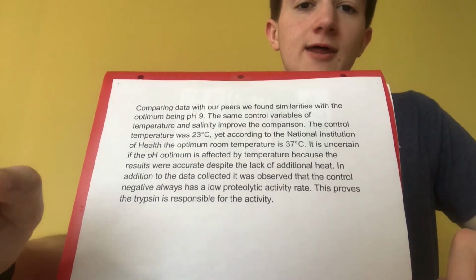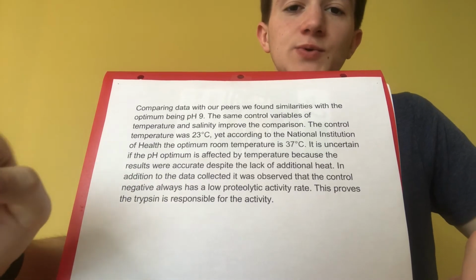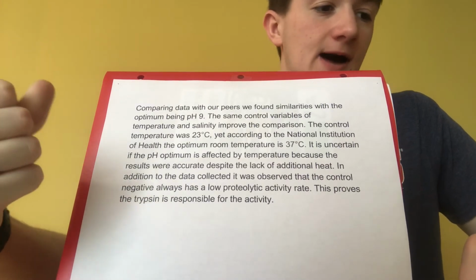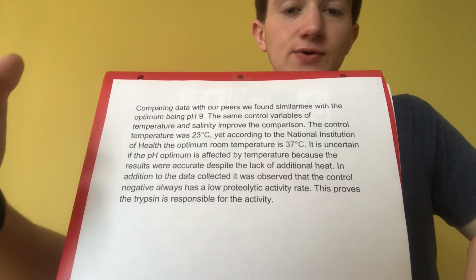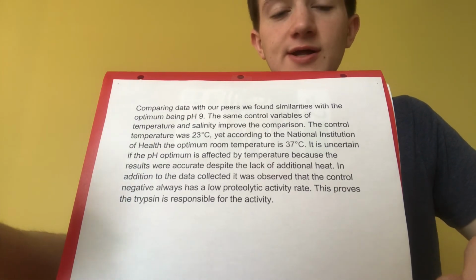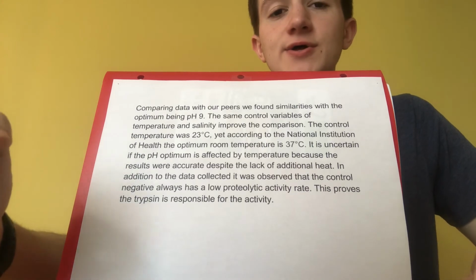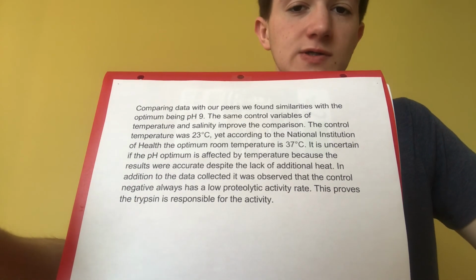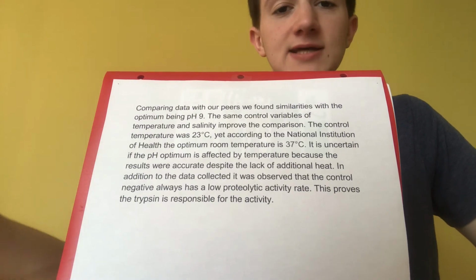Our conclusion that the optimum pH would be pH 9 suggests that the ideal conditions to grow bacteria would also be in the pH 9 range. So that way the activity of trypsin on azocasein would be at its highest point.